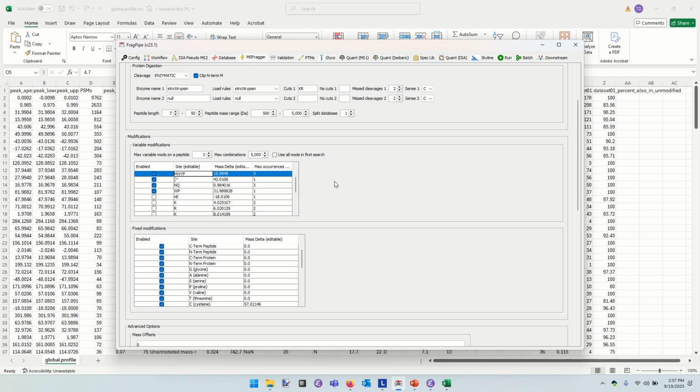If we added leucine or valine or isoleucine to our PTM roster, things would get a lot worse fast because those are very common amino acids by comparison. So searching for a mass shift on an amino acid has more impact on your search time if it's common. These are not. These are all fine, basically. N and Q are pretty common, but ultimately those occurrences happened enough that we need to take them into account.